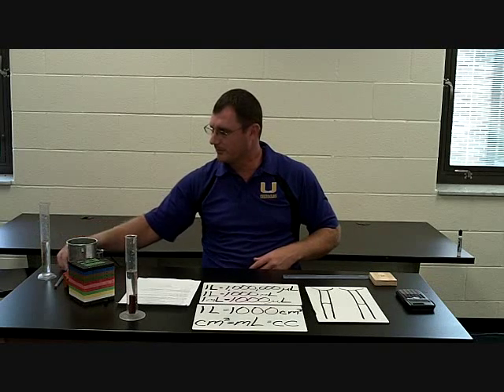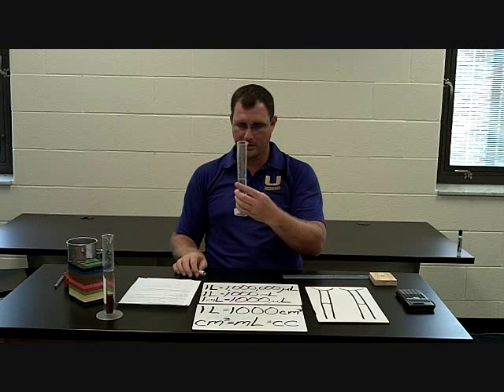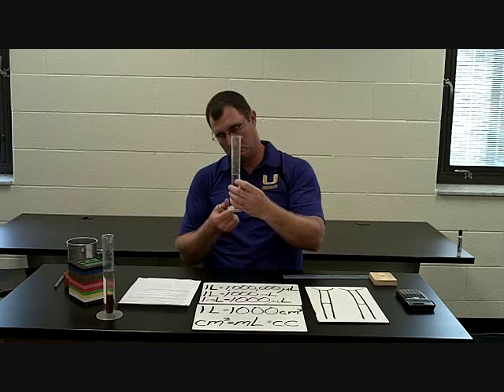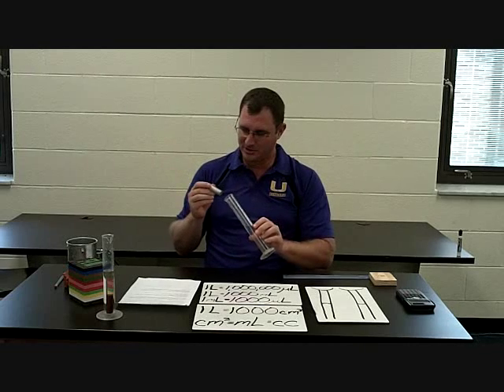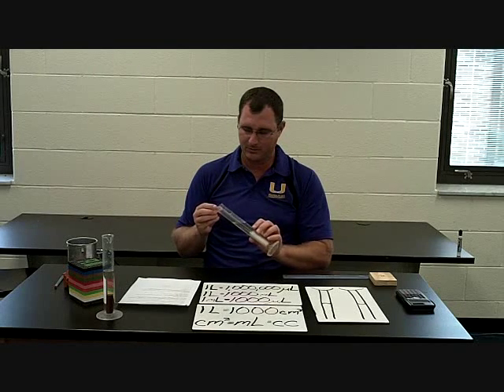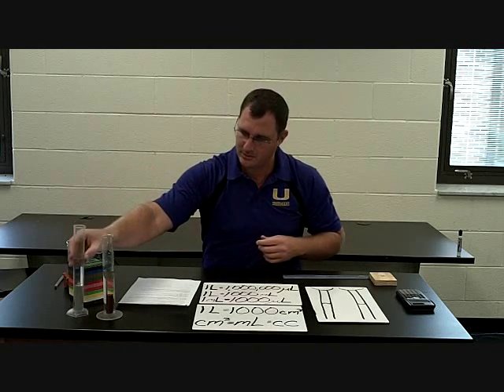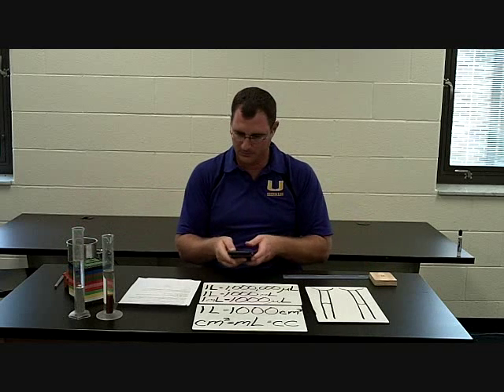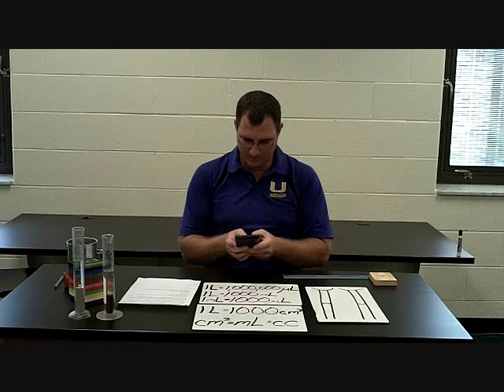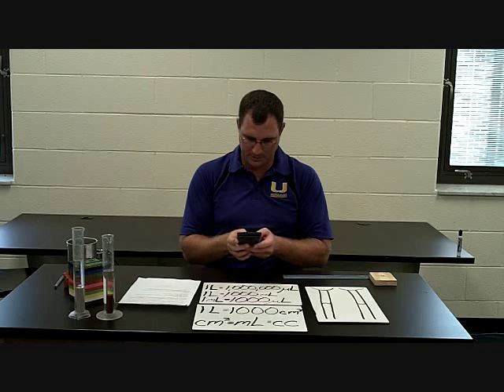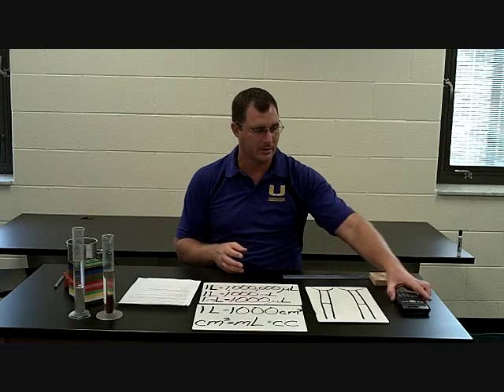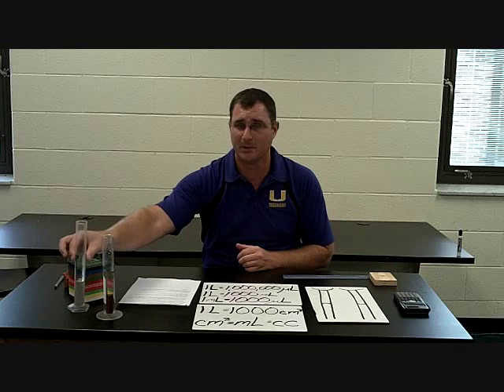For my aluminum cylinder, I'm going to take another graduated cylinder. My initial volume of water is 59.1 milliliters. Then I'm going to add my aluminum cylinder — it goes up to 79.2 milliliters. I do the math: 79.2 minus 59.1, and I get 20.1 milliliters. That was the amount of water displaced by that object.